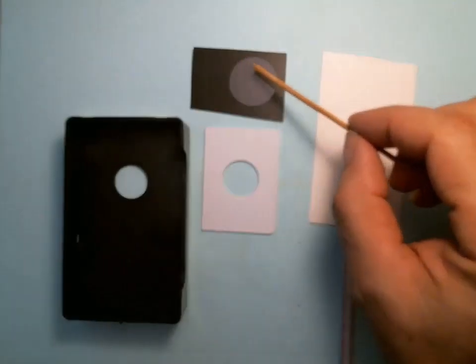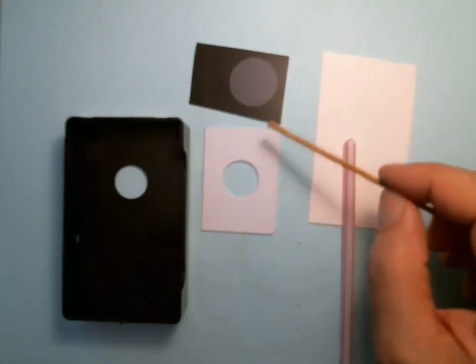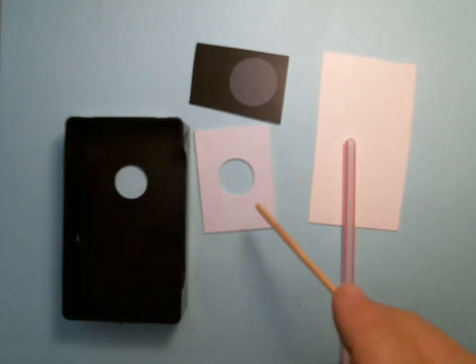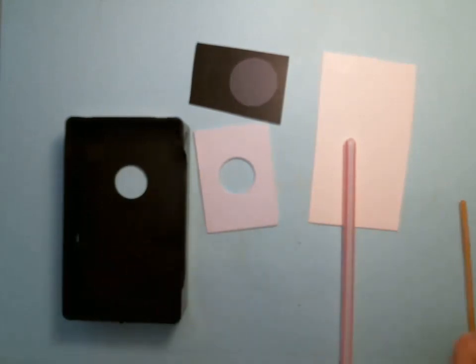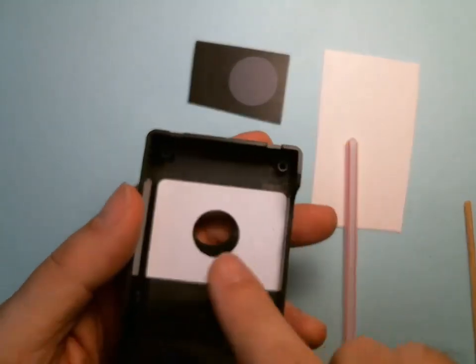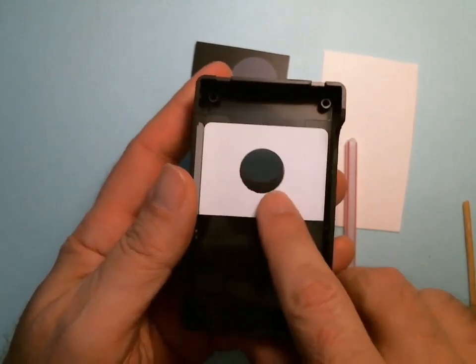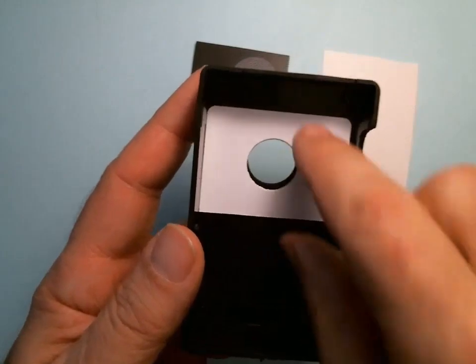So this is our 1-inch glass discs. We're going to glue it with the silicone sealer to the PVC plastic, and then we're going to glue the PVC plastic to the underside of the case. Notice that this PVC card fits perfectly in here. You don't have to cut it. You're just going to align the 2 holes once you glue it.